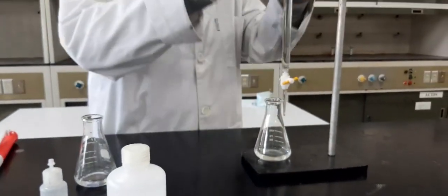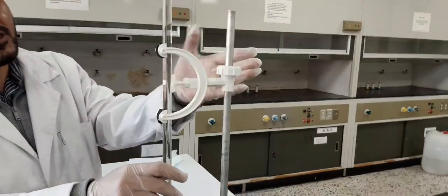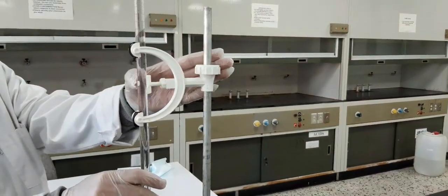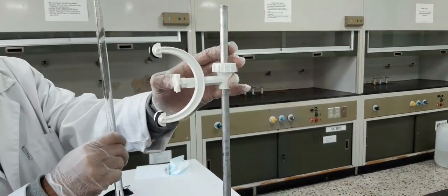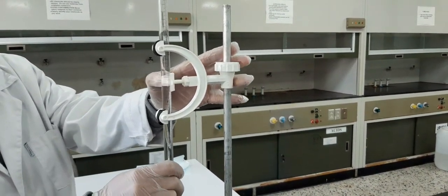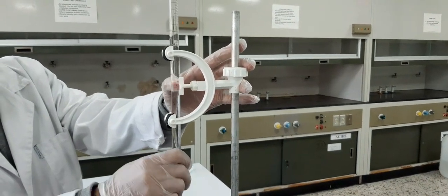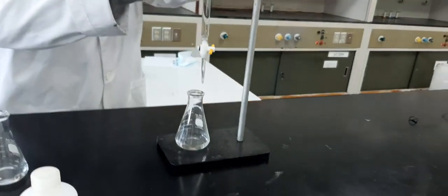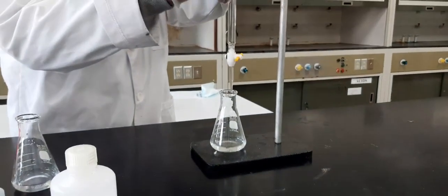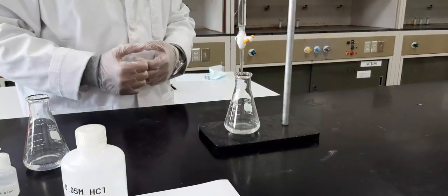It's a little bit down, we will make it a little bit up to adjust it. You can adjust by pushing this one. Look at this, this is my hand and this is my thumb with the left hand. When I push it, it goes down, and that's why we can easily move it up and down like this. Push a little bit and move it up, down. So now bring it a little bit down here. That's it, this is the best position. Now we can start our titration.